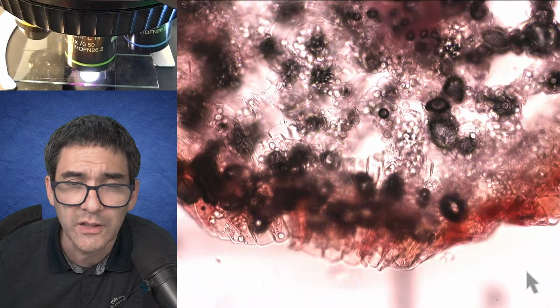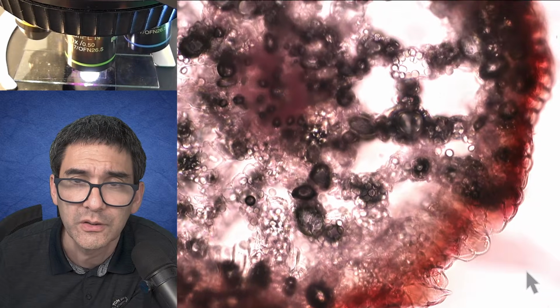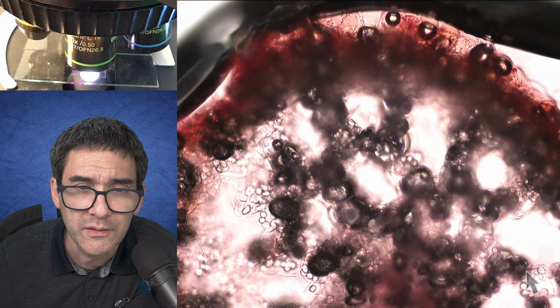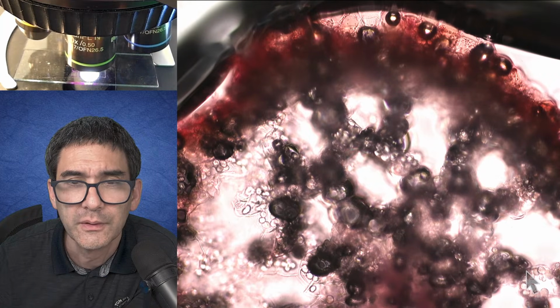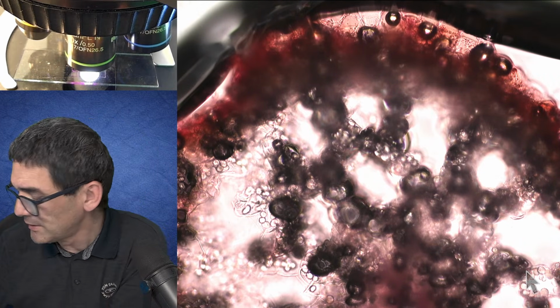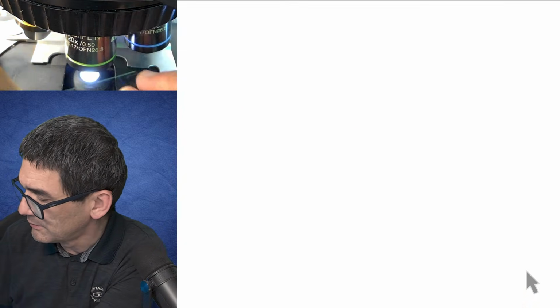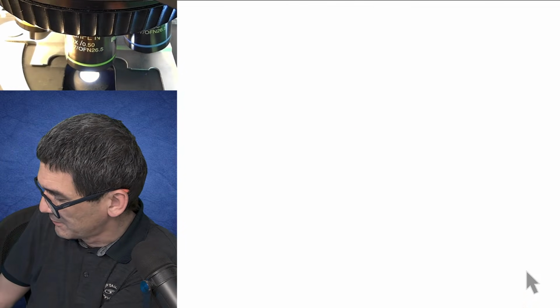as well. So that's why it kind of turned a little bit reddish in color. Yeah. And look at all of those bubbles that started to appear now. Yeah. So that basically means that there is indeed somewhat of a change in specimen stability.